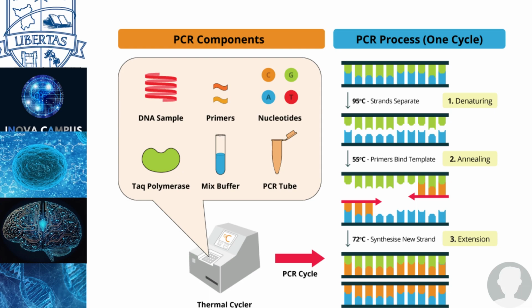So when we heat it up, it will unbind. Our DNA is not very resistant to high temperatures, as y'all know. So it will unbind, and when it's unbound, they let it cool down.